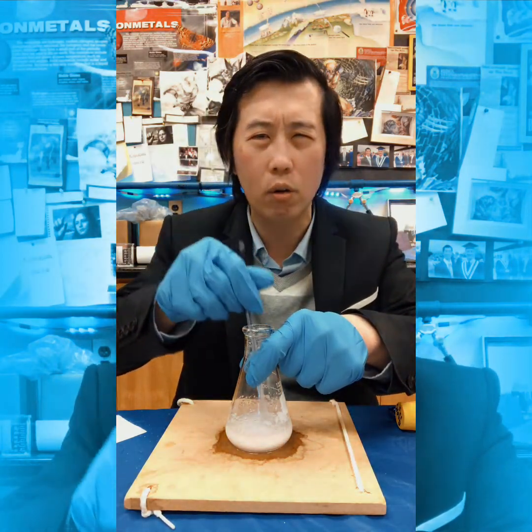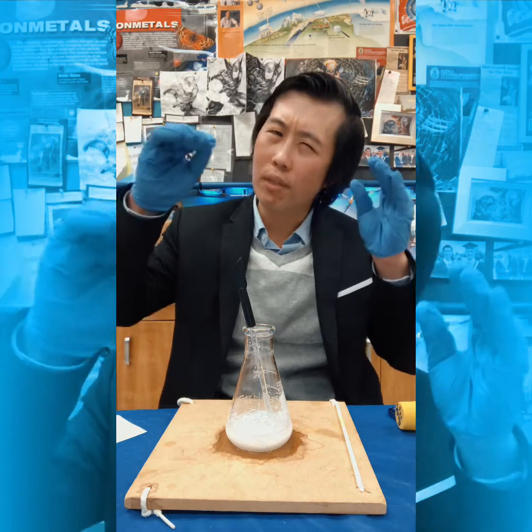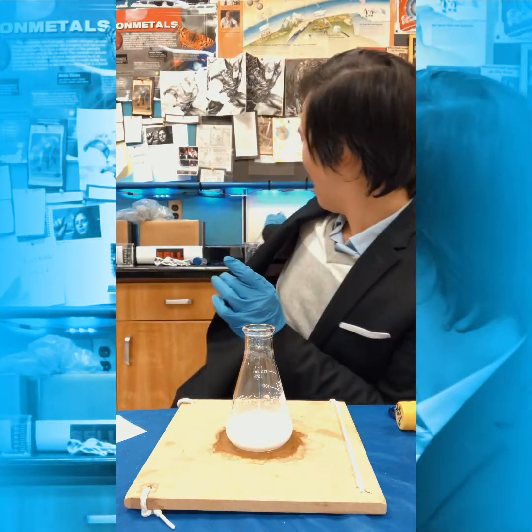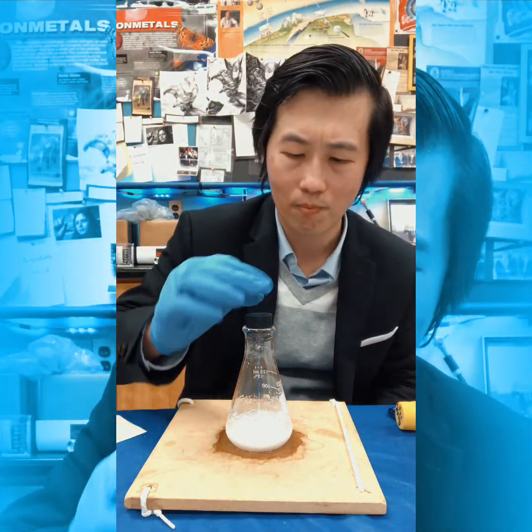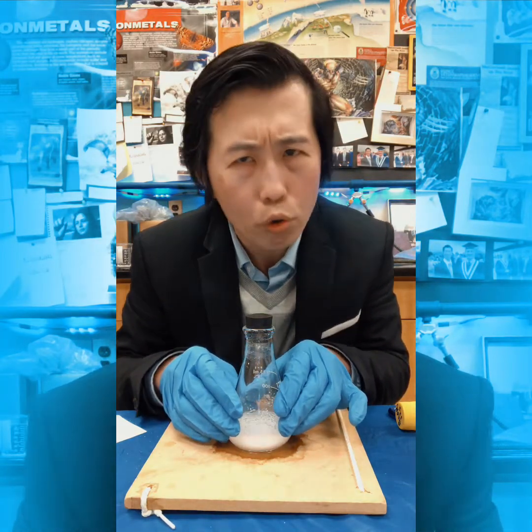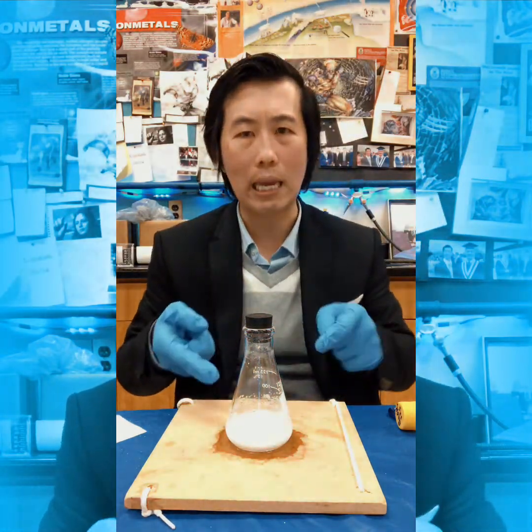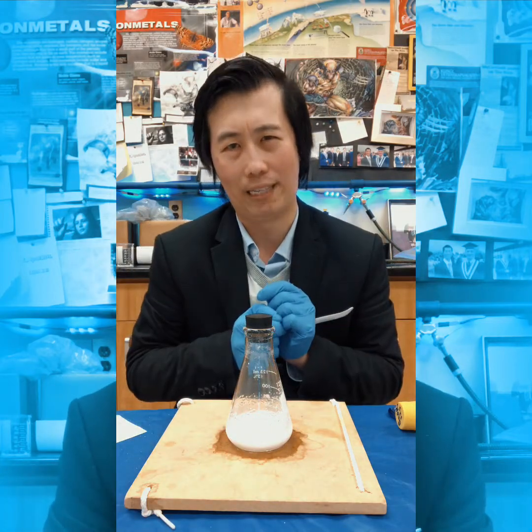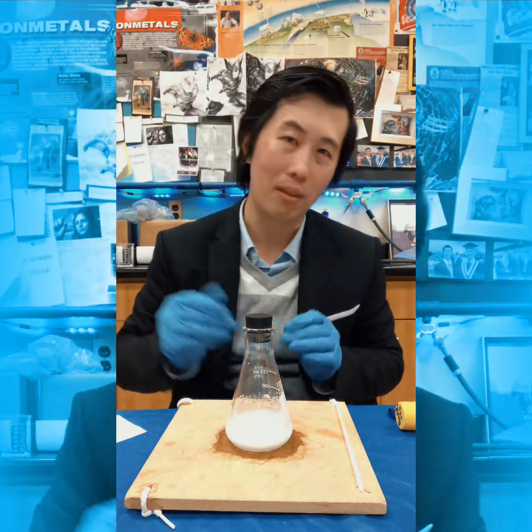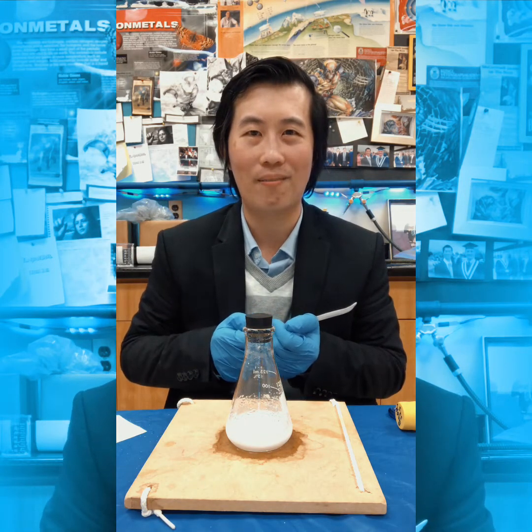It is very, very cold. By stealing the energy from the surroundings, the temperature is getting colder, and you could feel that it's quite cold actually. I'm going to put a lid on top to capture all of that energy. It's very, very cold, okay? Now, it's so cold that it's able to freeze that water underneath. That water has become nothing more than ice, and it has allowed the glassware to adhere to the particle board.